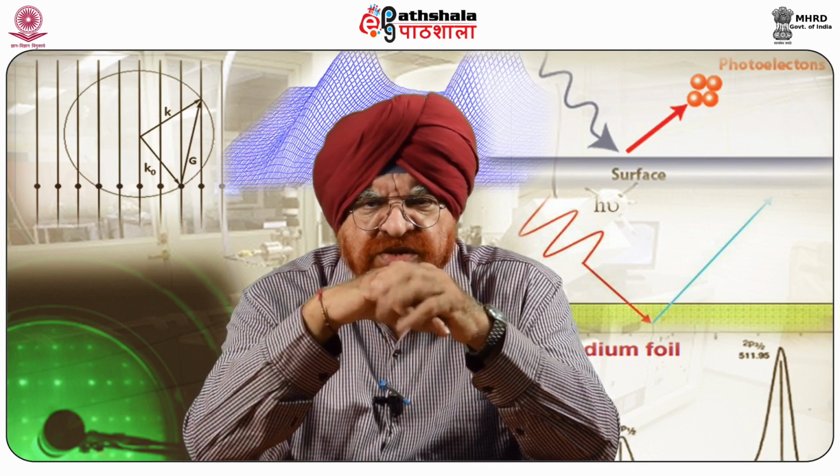Spatial distribution information can be obtained by scanning the micro-focused X-ray beam across the sample surface. Depth distribution information can be obtained by combining XPS measurements with ion milling or sputtering, as we put it, to characterize thin film structures.